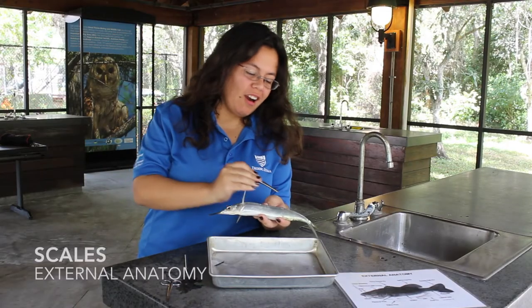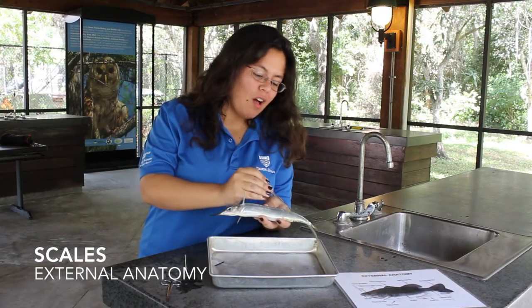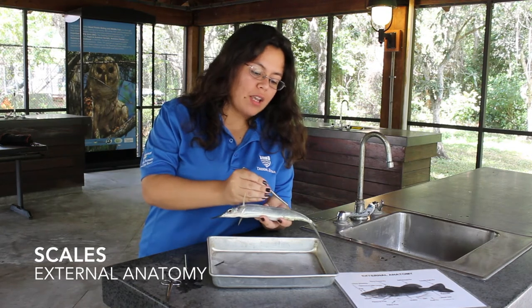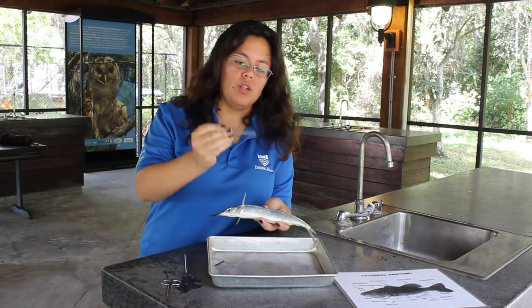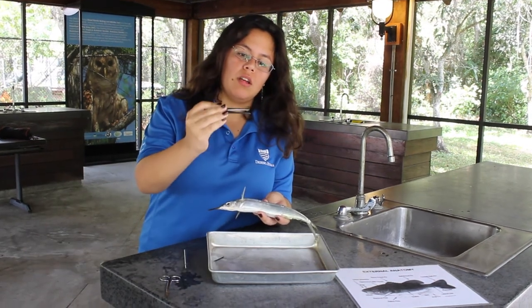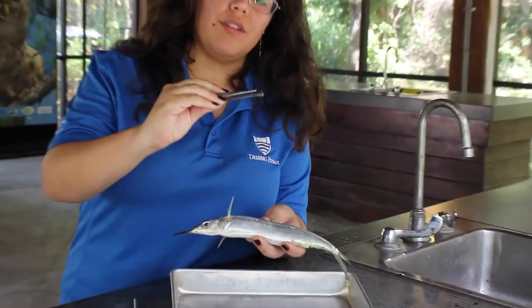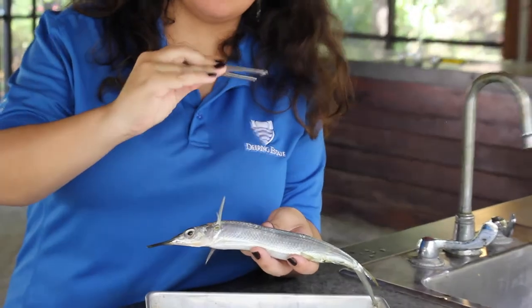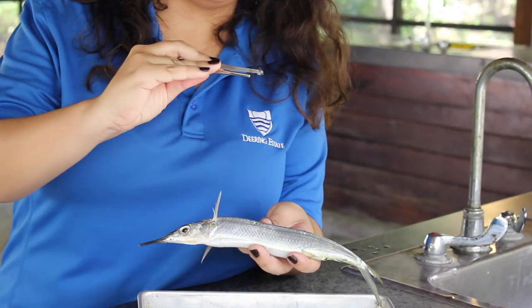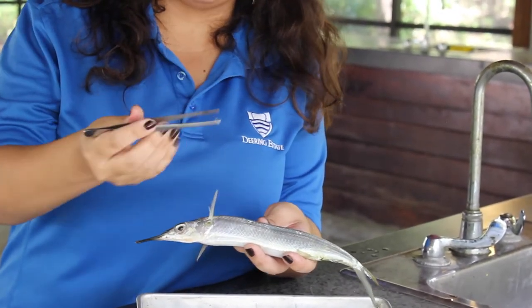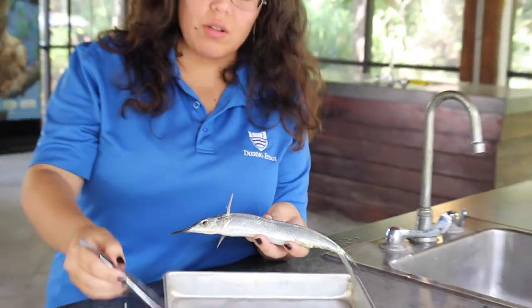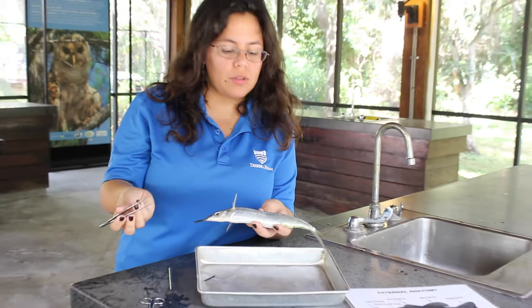Another key feature are the scales. All fish have scales — even sharks, they're just very small. You can see here this clear feature; this is the scale itself. In some fish you can actually use the scale to age the fish.